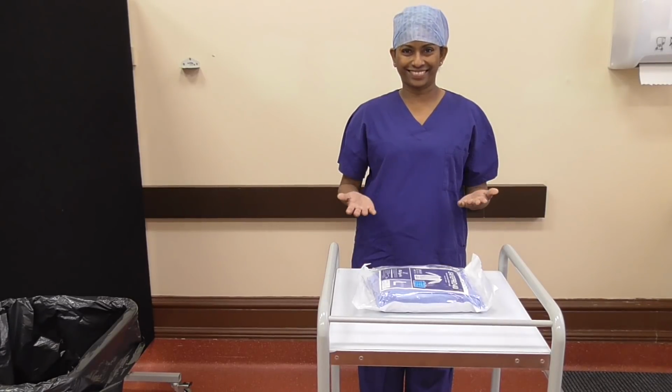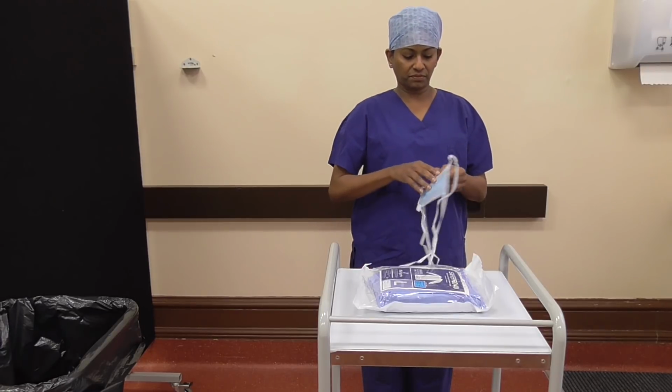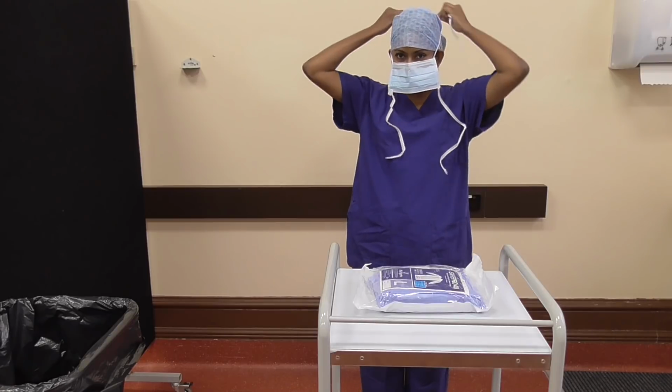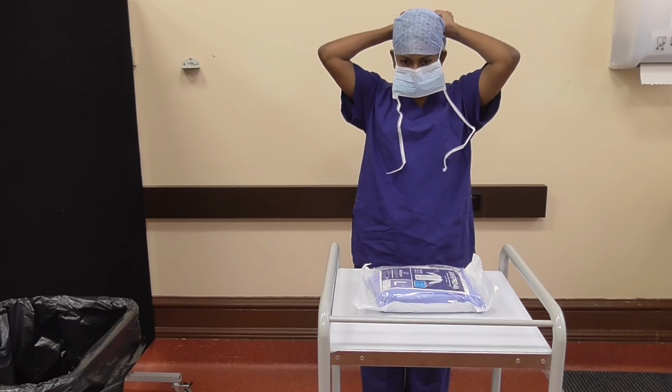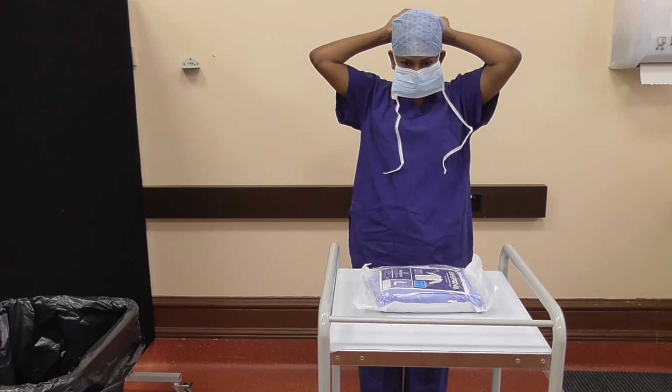Remove jewelry and perform hand hygiene. I have prepared my equipment and I'm going to start the procedure. I'll make sure that my mask is tied securely and I will ensure that it covers my chin and is not loose.